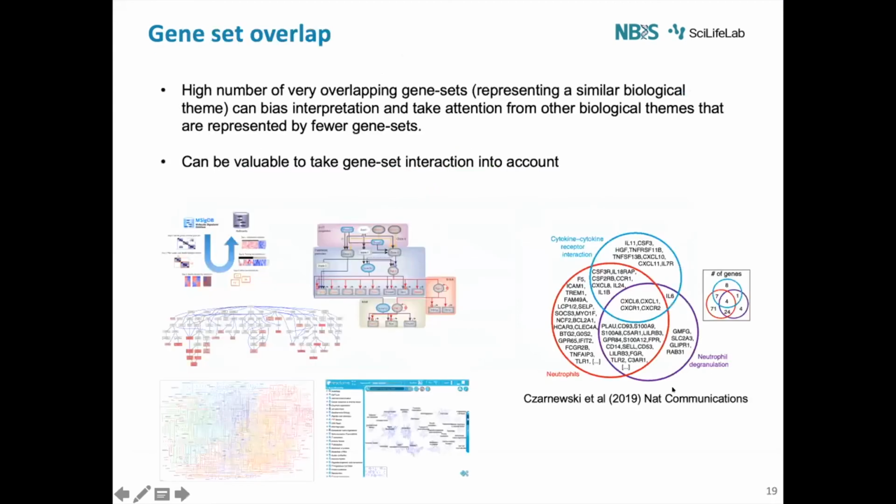So one thing to consider is that there are a lot of genes that will be overlapping in all those pathways that you will see. So many of those terms will also be present there. Because of this high overlap of genes belonging to many pathways, it is possible that when you do a differential gene expression and have many significant genes, the top pathways will be relevant to one pathway. Maybe like 10 terms will belong to the same pathway, let's say lipid metabolism.